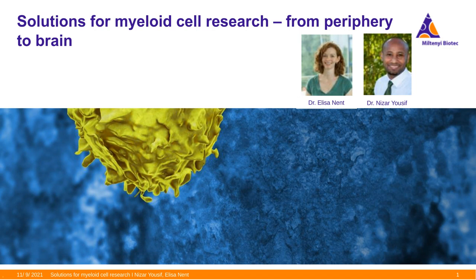And if you want to be sure to omit all microglia, you could go for TMEM119 low, because this marker is quite unique for microglia. And if this marker is low, it should be a monocyte. So you could try those options for sorting. But I think magnetic cell isolation wouldn't work in this case because those two cell types are too similar in case of the inflamed brain. I hope this helped you a bit, but for sure you can also write me and I can also try to send you additional material on those products.